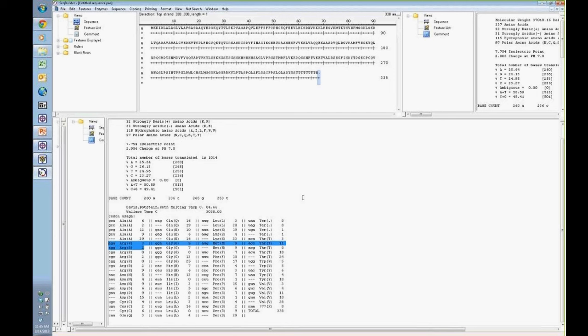As you further evaluate what you're seeing on the gel, maybe you see some truncation, and you can't figure out why that's occurring. Well, in this specific case, 5 arginines in a sequence is not overtly significant, but typically with 8 to 9 rare codons, there's a possibility that it may affect your translation, causing truncated results, low expression, and so forth. Depending on what you're seeing, you may want to think about using a competent cell that has some tRNAs for these rare codons to get a more efficient expression. For example, EMD Millipore has the Rosetta series of strains and so forth.